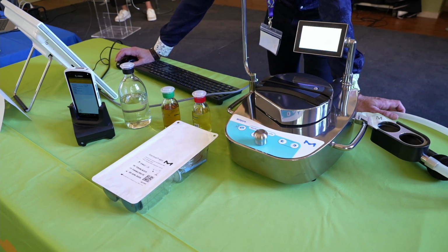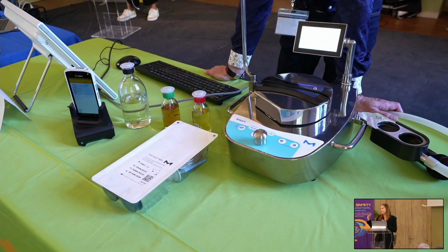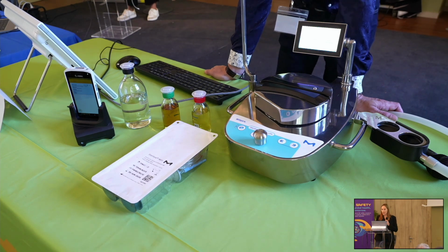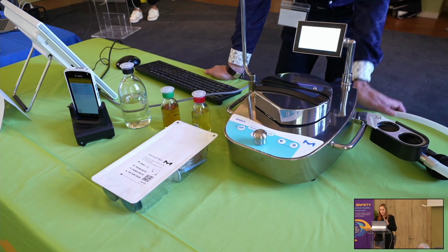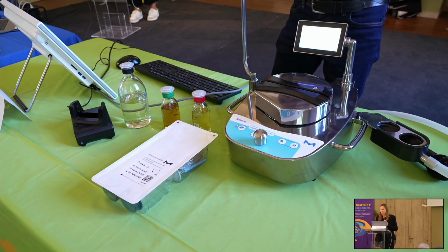And then in the sterility test screen, the SOP will be displayed. So we will see the procedure of our SOP step by step. And this will avoid mixing up procedures.